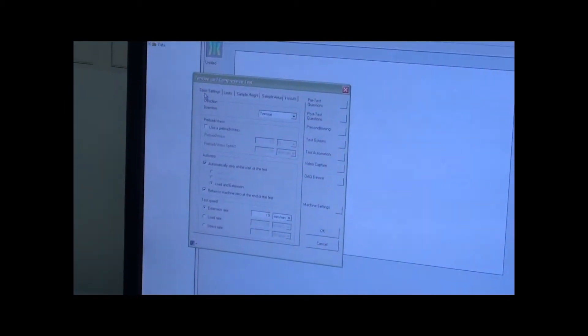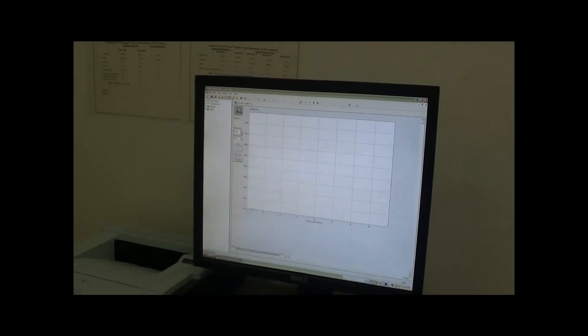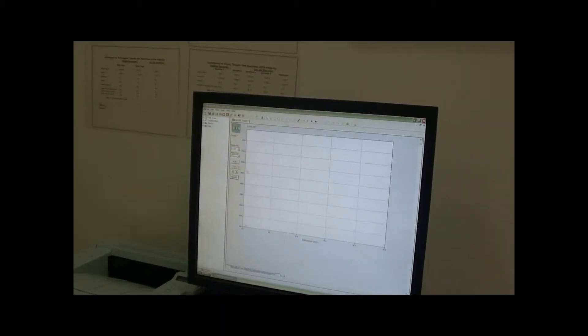When you click on the software, this basic setting is there. Here we need a graph of load versus extension.